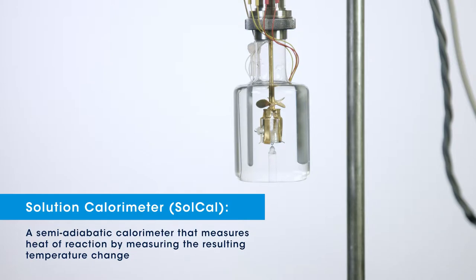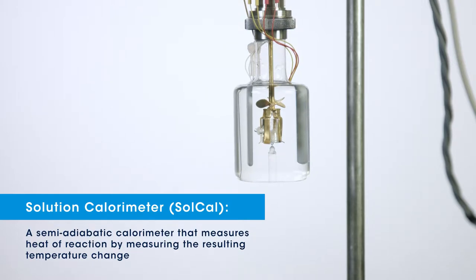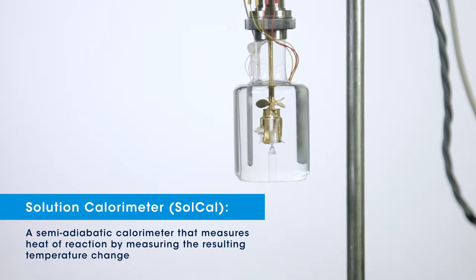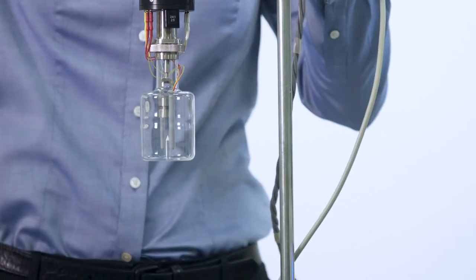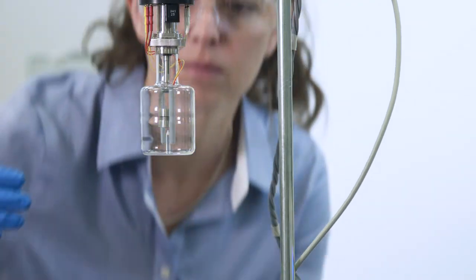The SolCal is a semi-adiabatic calorimeter that measures heat of reaction by measuring the resulting temperature change. The temperature of the solution calorimeter and the reaction mixture is measured by a thermistor.